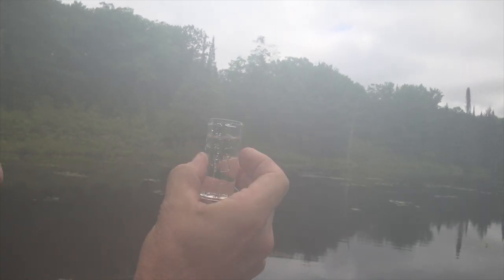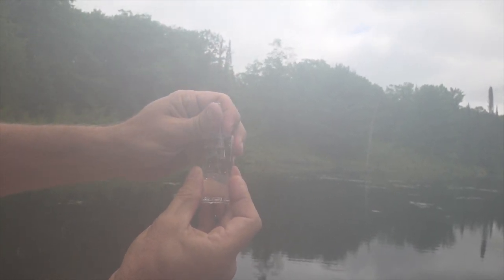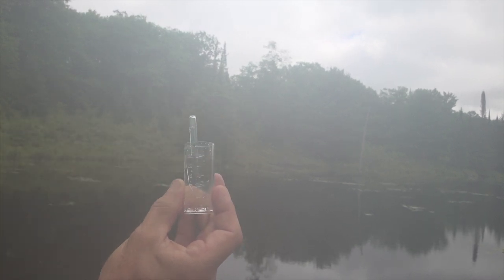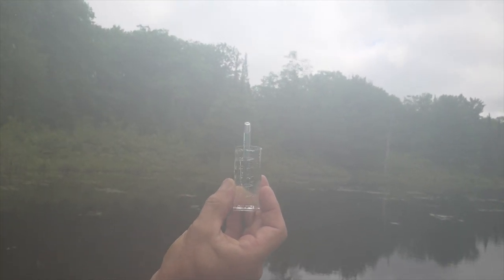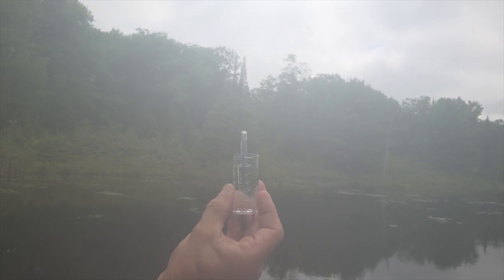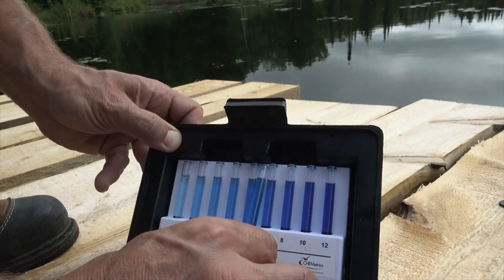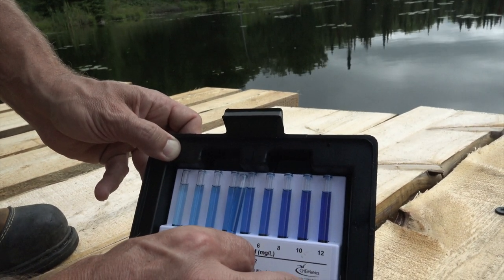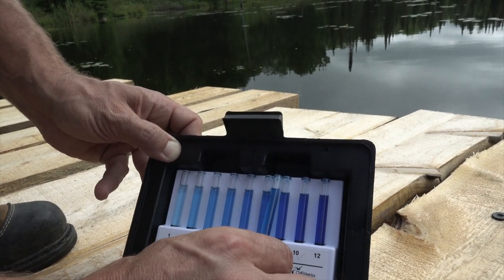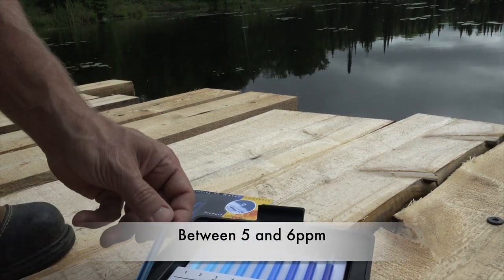25 mils. You take this little gizmo — it's vacuum sealed in there — and it's going to suck up that water. You just break the tip off; there's a little channel you put the tip in. We had problems with our cameras and had to switch cameras, but there are fish in here, so that gives us an idea of what our dissolved oxygen is like.